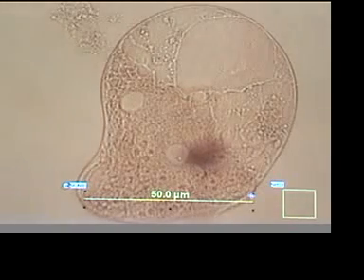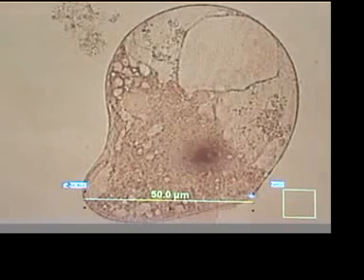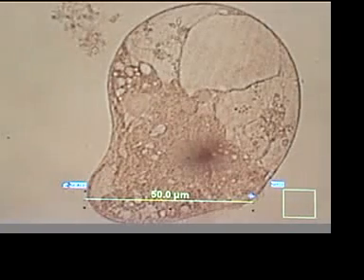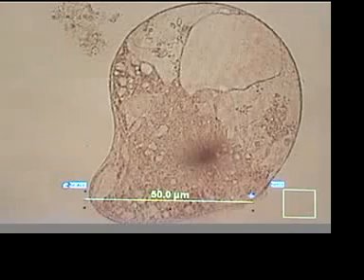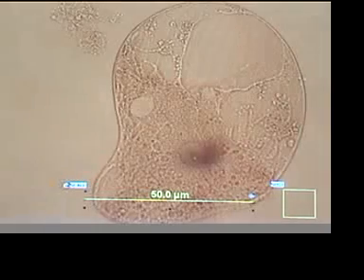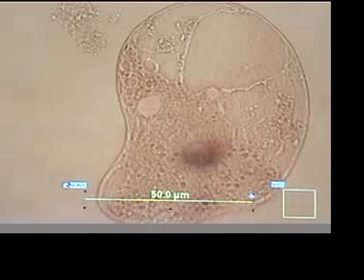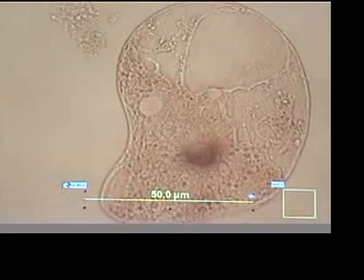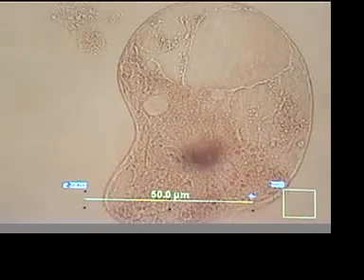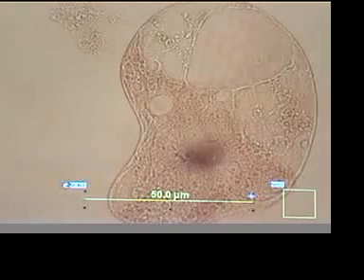He is really badly misshapen now. I'm going to experiment with the focus a little bit. You'll see some different highlights of the organism. He's essentially transparent, so we can look down through him. We're now at 924 hertz. It's very interesting. Almost looks like there's a hole in the center of it that's opened up. I don't know if it's a hole in the cell membrane. It's amazing. It looks like almost like a little vortex.